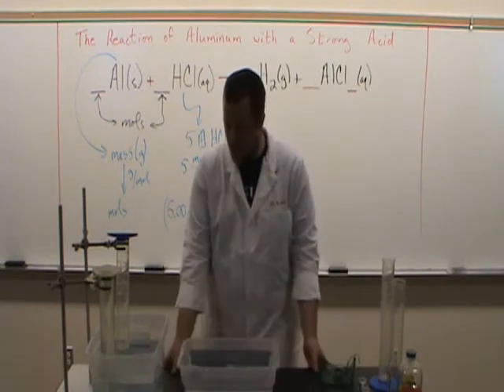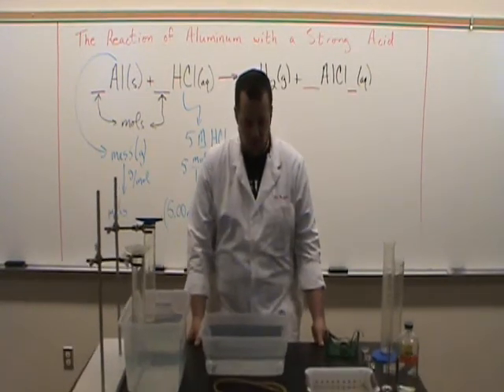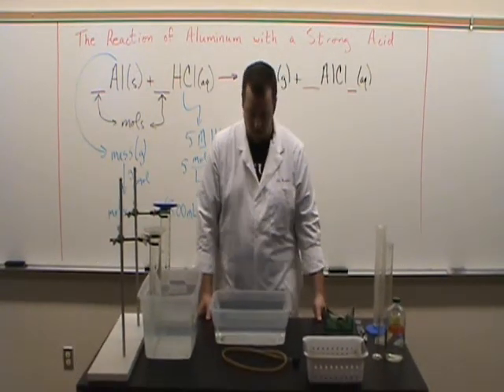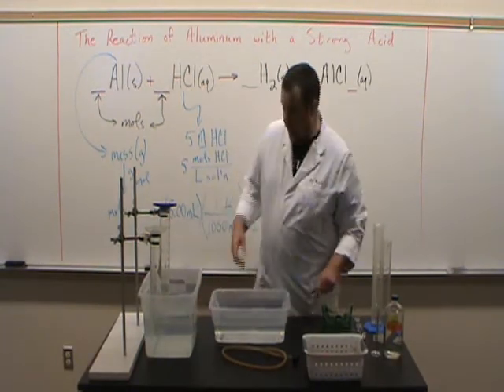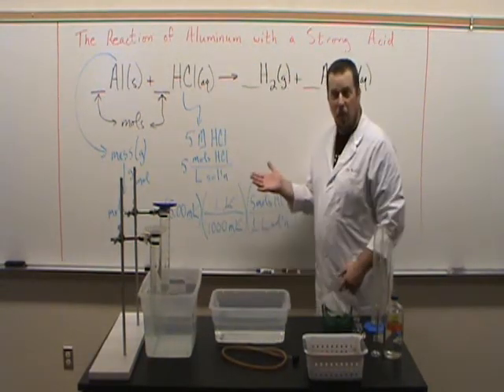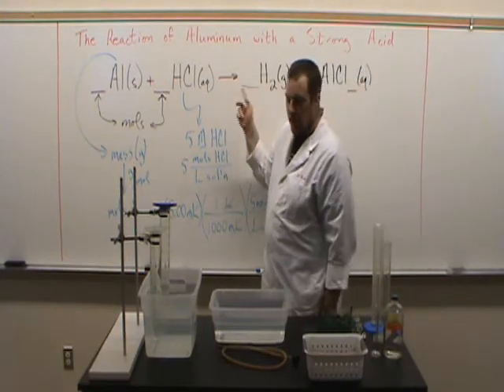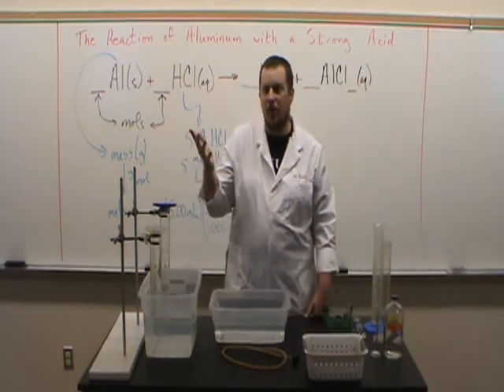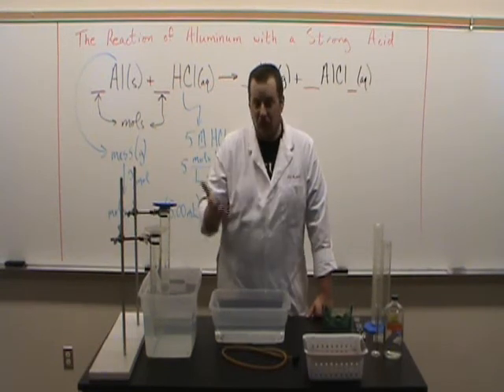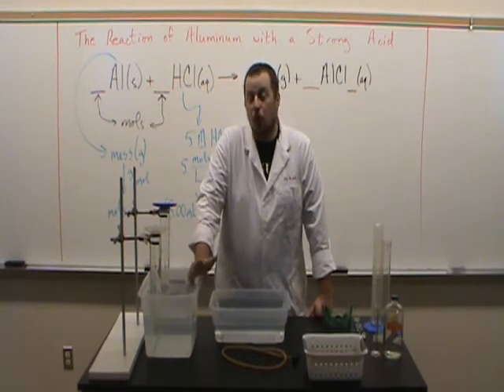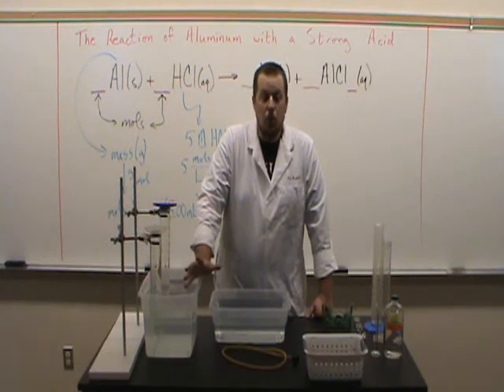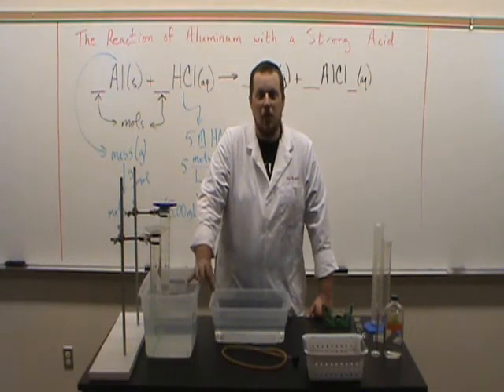So how are we going to do it? Here's our setup, and let me pull this back a little ways. I said the reason we're doing this experiment, or the thing that we want to observe, is how much hydrogen gas is generated. But how do we determine how much hydrogen gas is generated? It's really convenient, if we want to measure a gas, to collect that gas by displacing water.